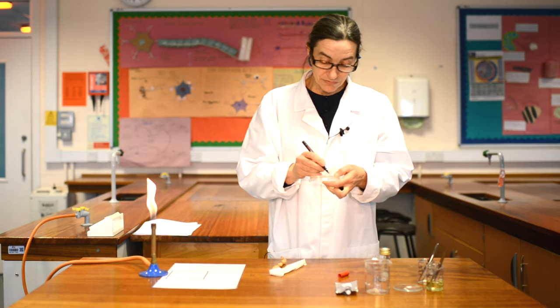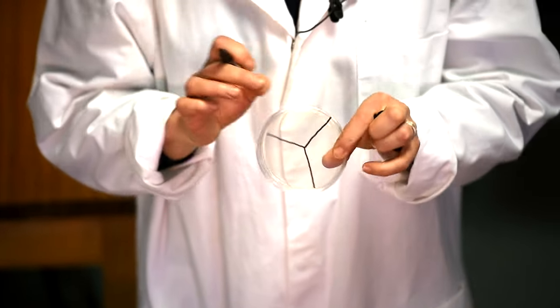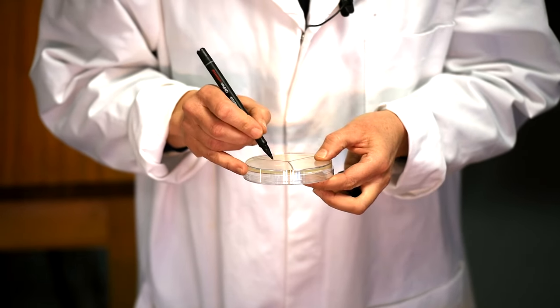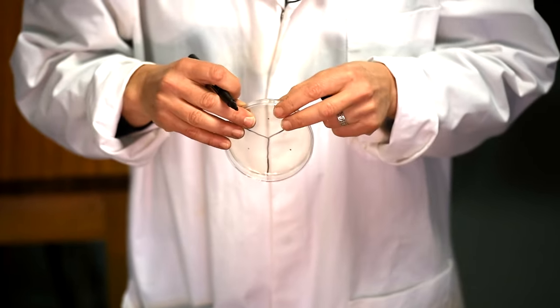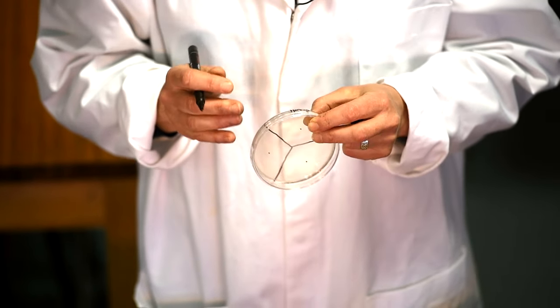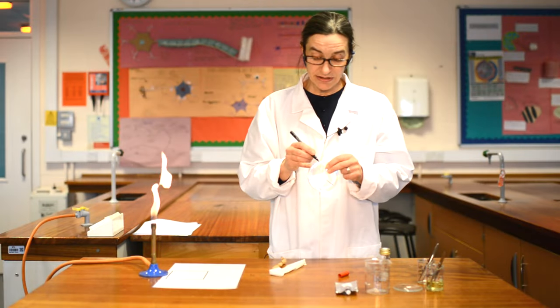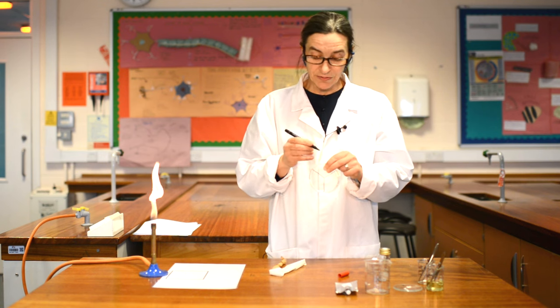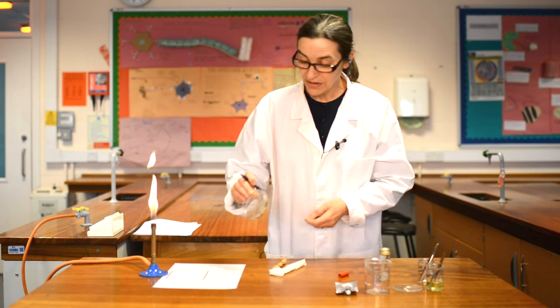The first thing we're going to do is mark the agar plate into three sections. If you've ever handled one of these before, you will have automatically labelled the bottom, not the lid — it's the bit where the gel is that you want labelled. You're going to put a spot into the centre of each triangle because we're going to be using that later. Because we are actually working with a real bacteria, write E. coli on the side clearly, along with today's date and your initials.